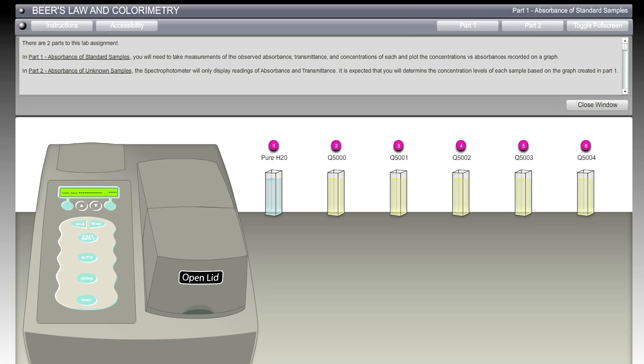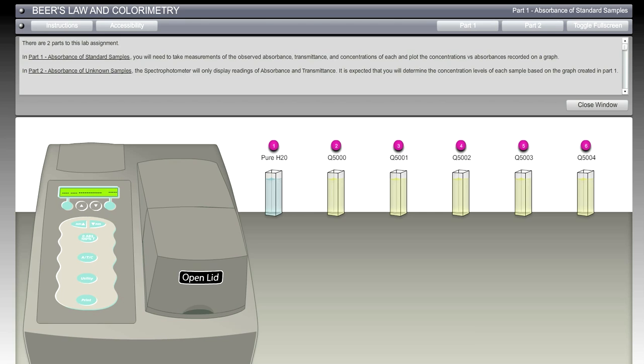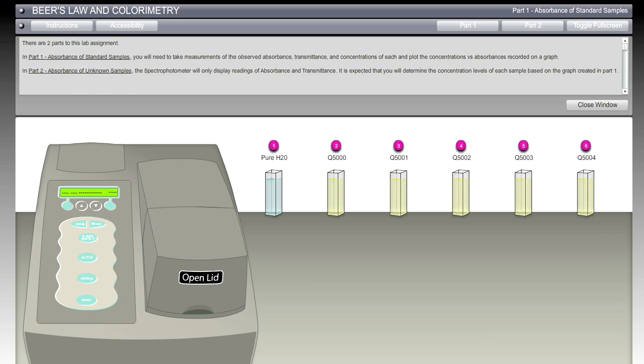We click on Part 1 and are presented with six different vials. In Part 2 we're going to get the absorbance of unknown samples. These first standard samples are going to drive the data for students to be able to figure out the absorbance of the unknown samples. The spectrophotometer will only display readings of absorbance and transmittance. Students will determine the concentration levels of each sample based on the graph in Part 1.